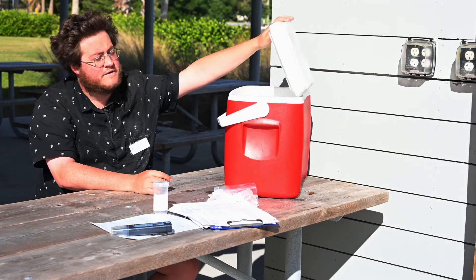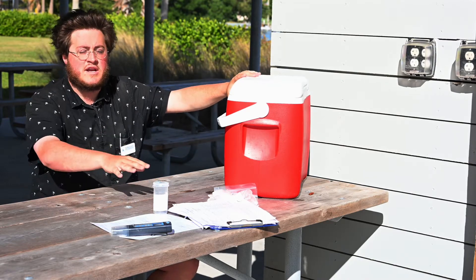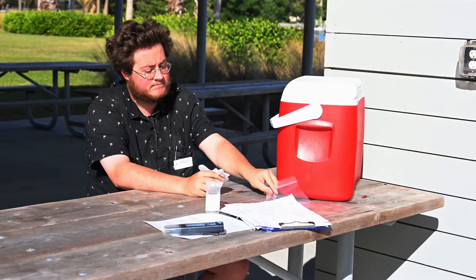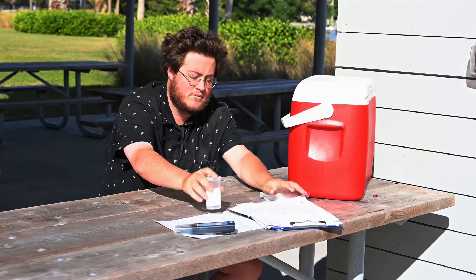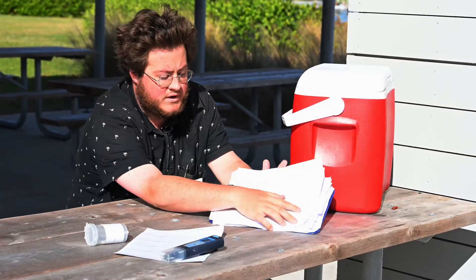You'll need your cooler filled with ice that your samples go into after they're collected. You're going to want to make sure those samples are buried underneath the ice so as to not be showing above it. Next, you'll need some gloves to collect samples with, and bags to put the sample bottles in once they're collected.